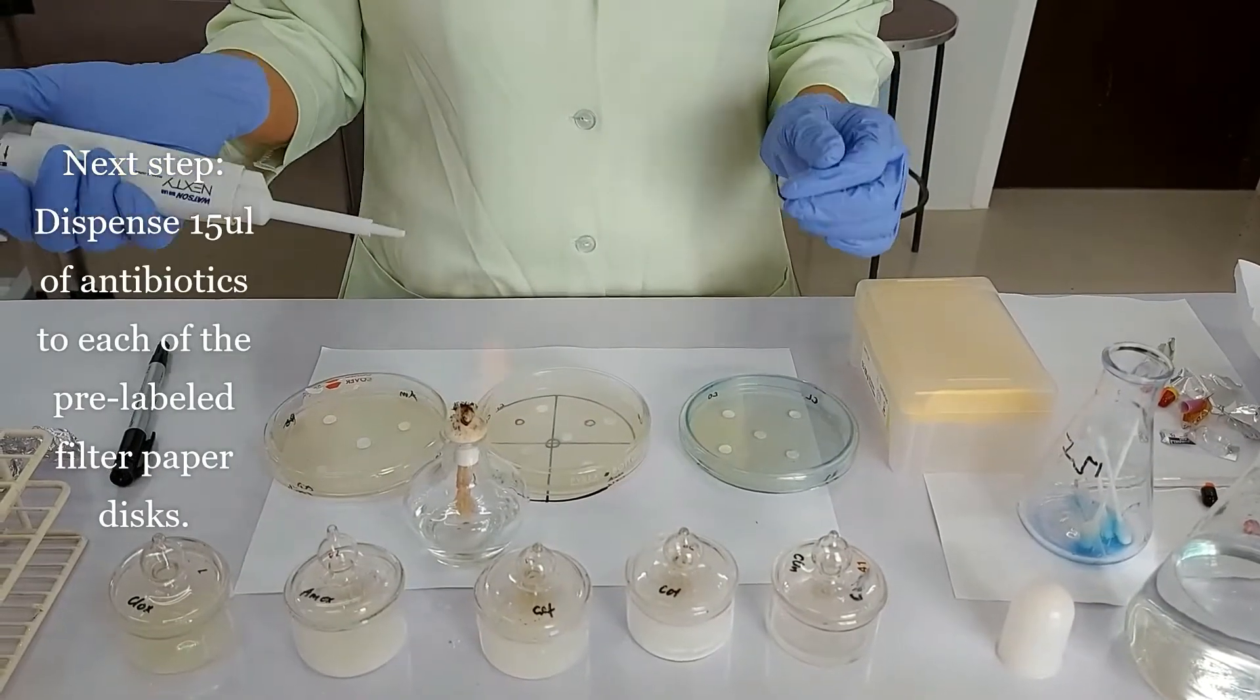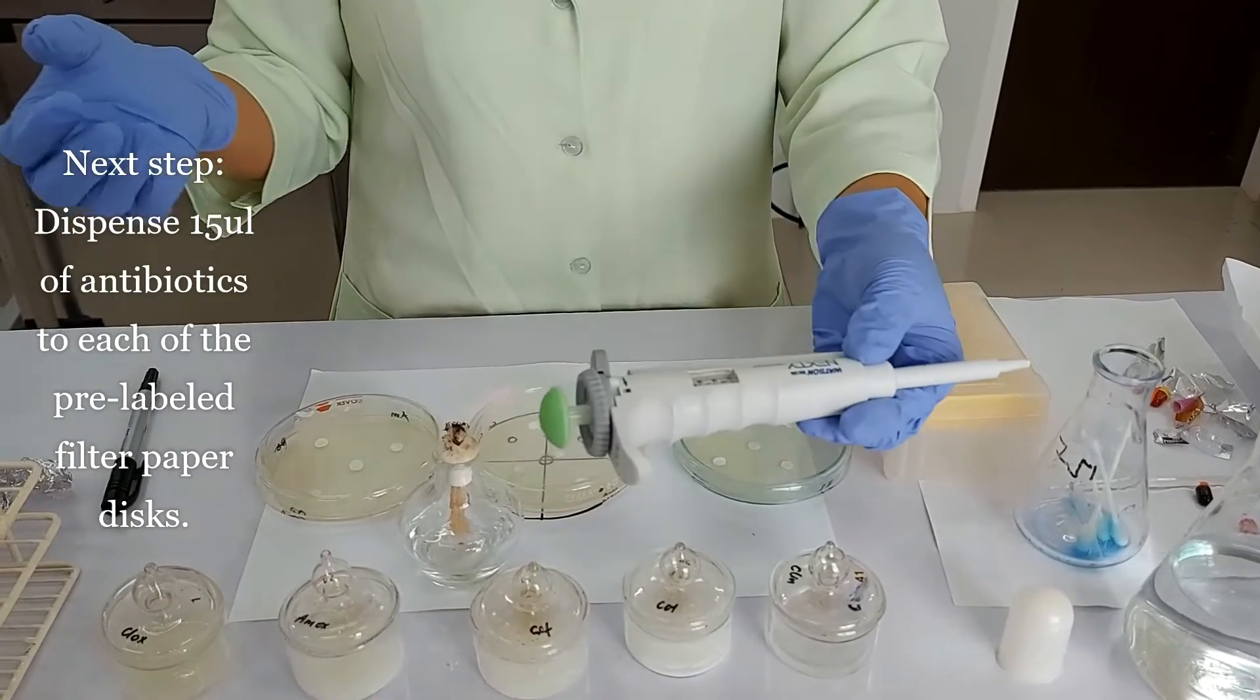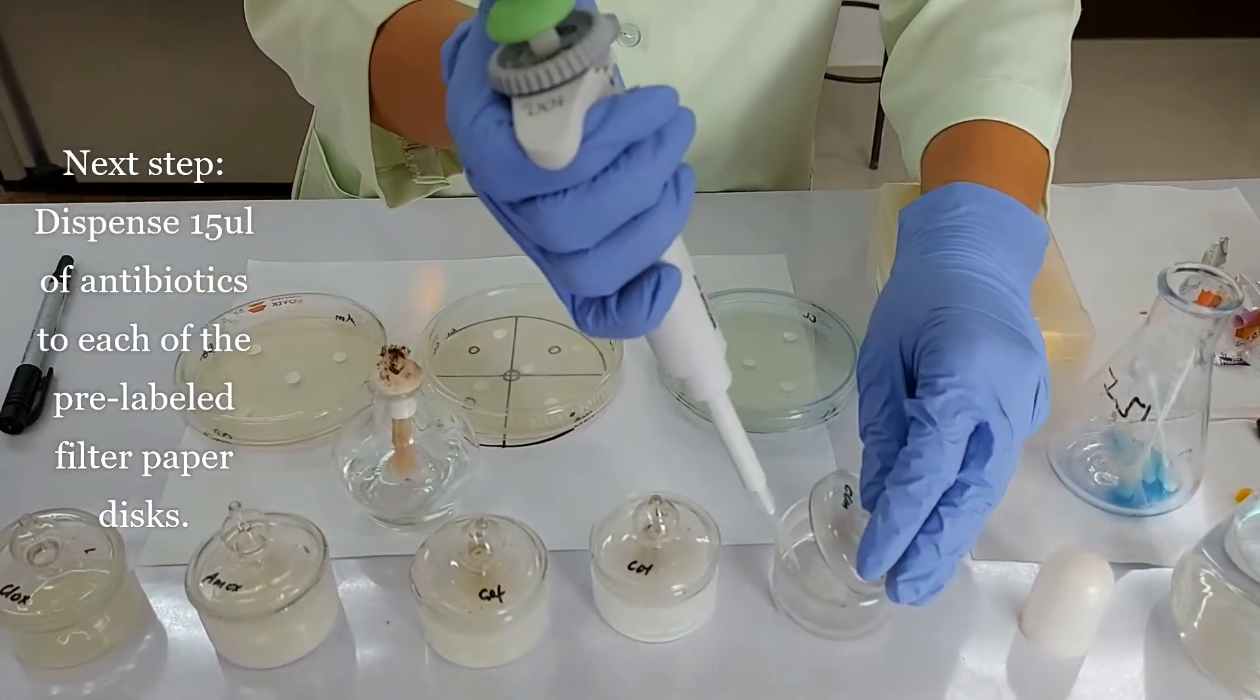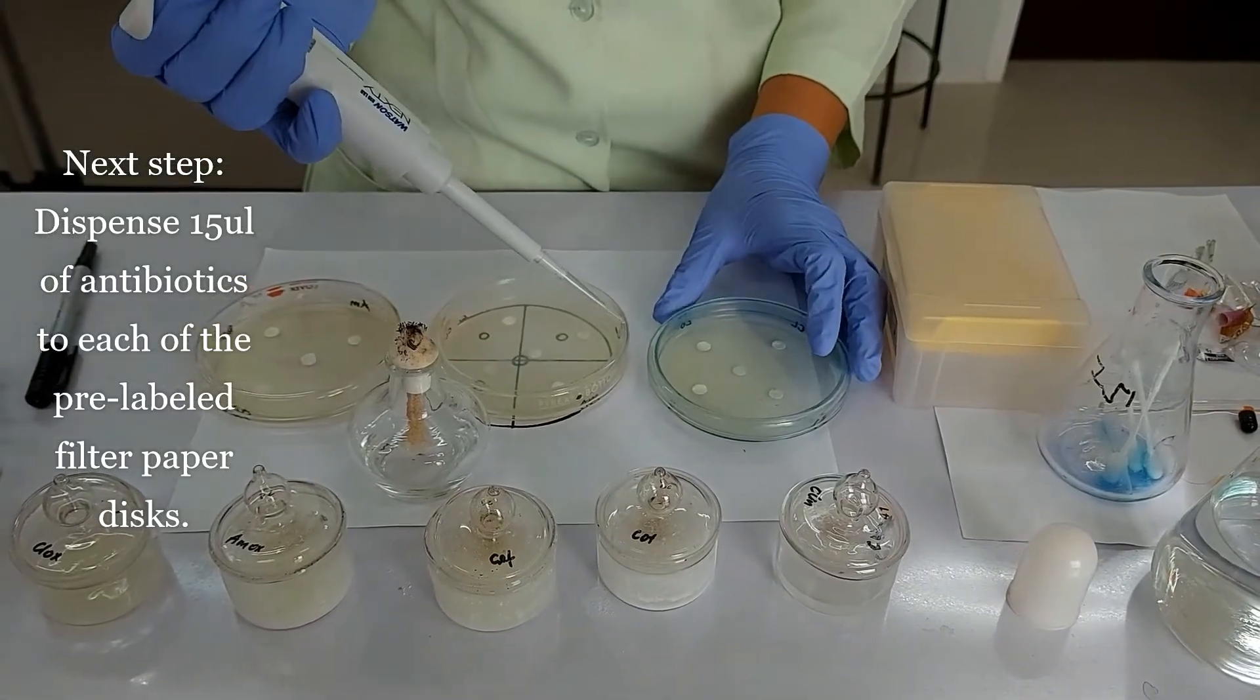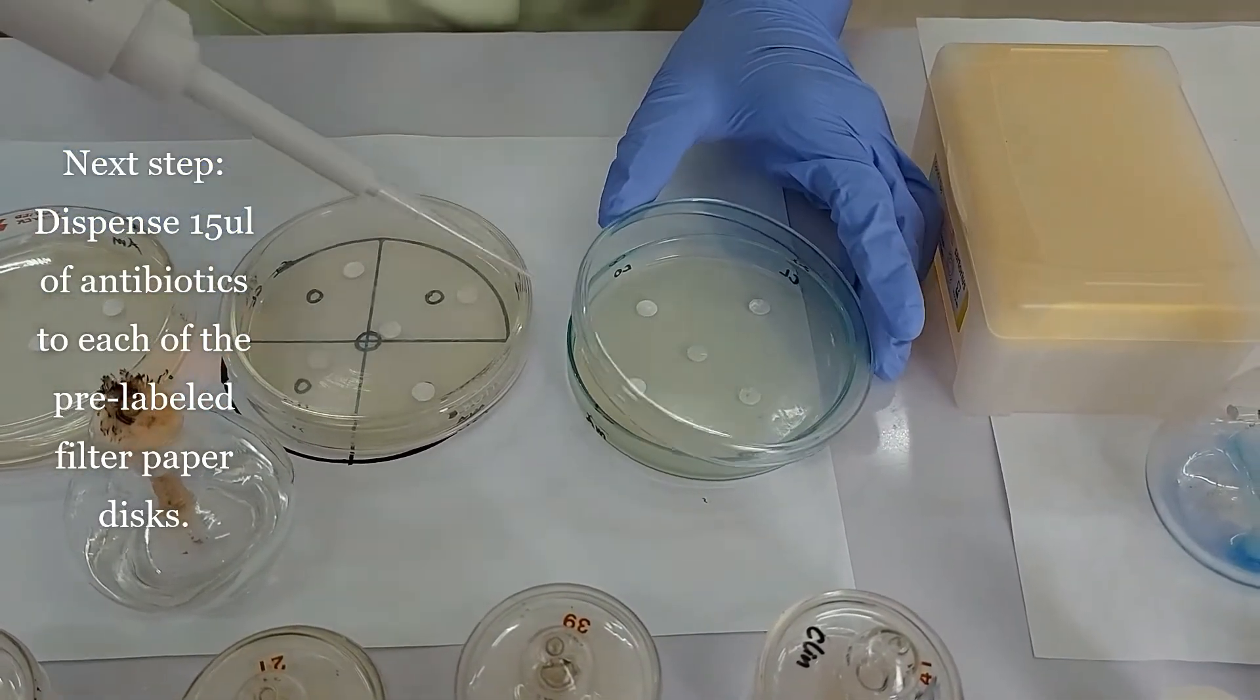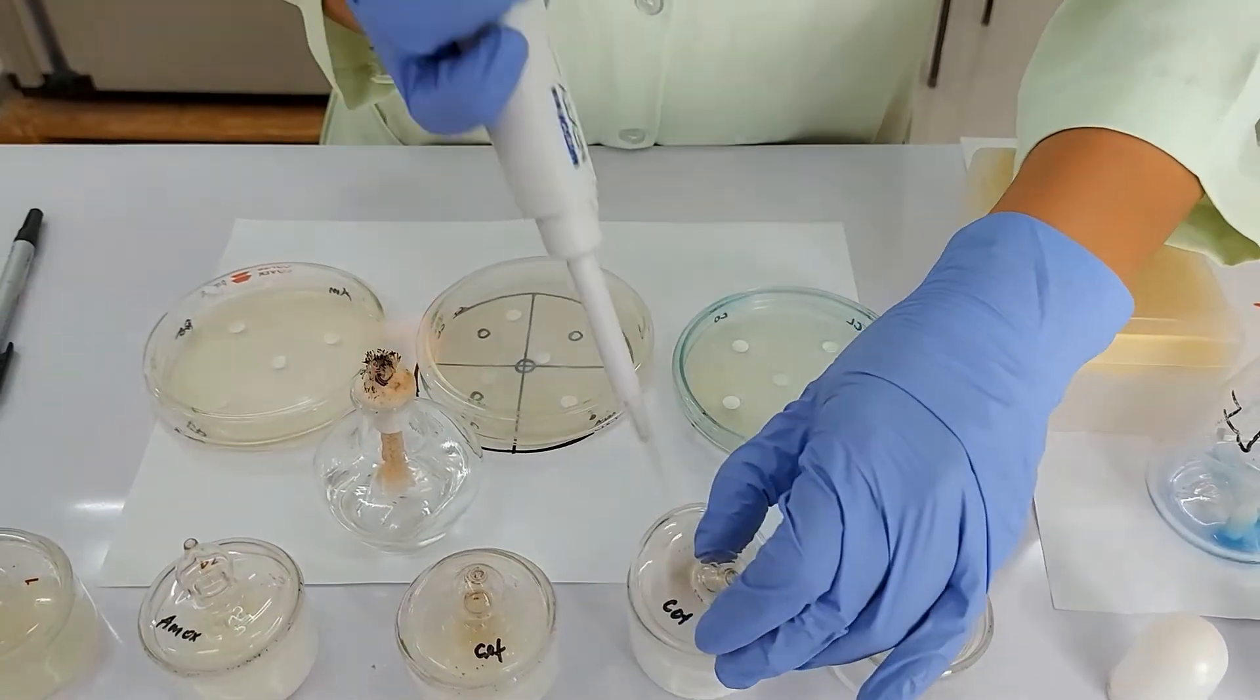The next thing that we are going to do is to dispense antibiotics into each of these designated filter papers. We are going to dispense 15 microliter using this micropipette. I'm going to dispense this at the center, making sure it's not dripping all over the surface of your agar.